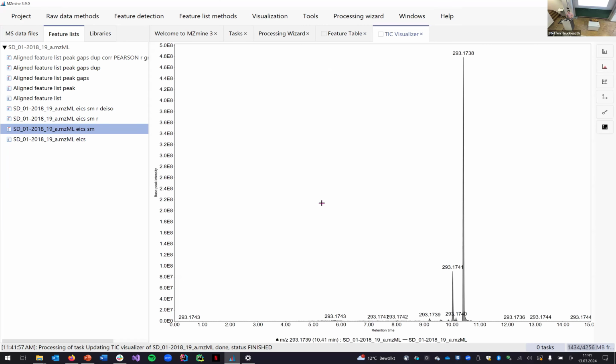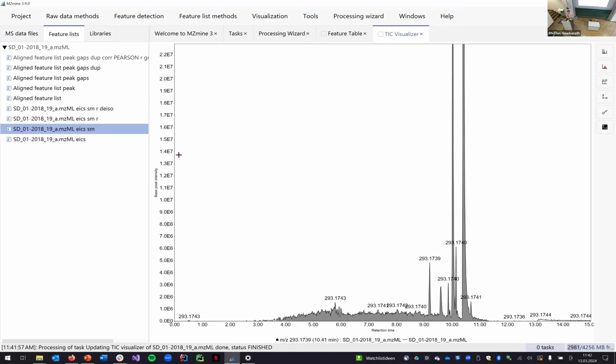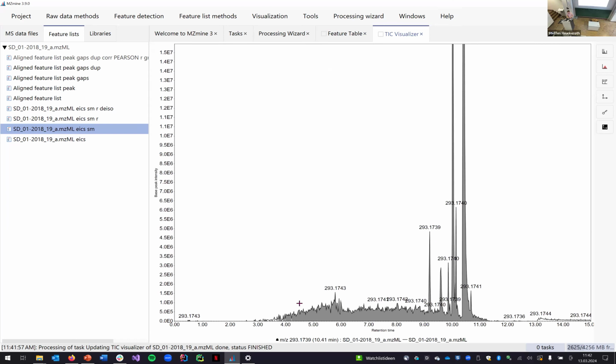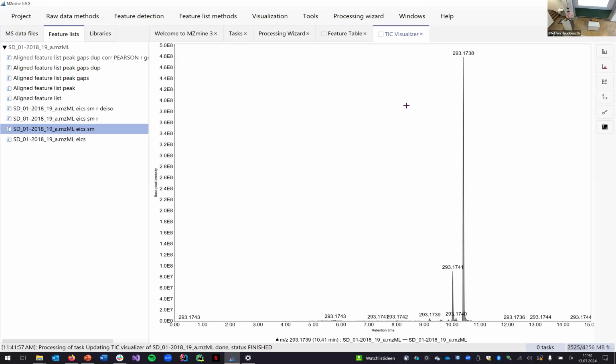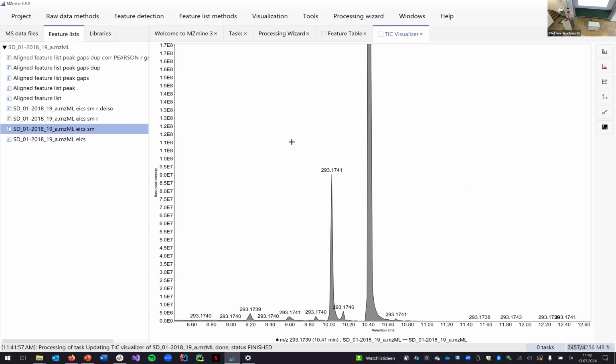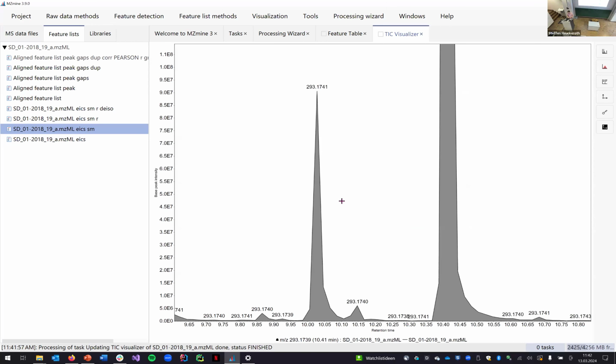And then we get the full chromatogram across the whole retention time range for that mass to charge ratio. And in this plot, we can, again, as we did before, zoom in. We can see, okay, we have some noise in here, but on that noise, we have a lot of different signals. And what we can check is, okay, how many points do we have per peak?